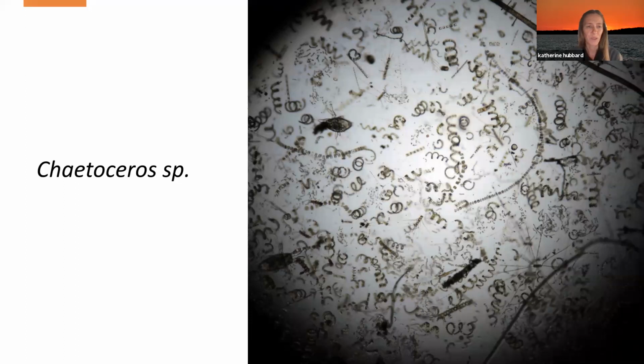And it's the same for Pseudonitzschia. Pseudonitzschia is weird because it's not always a toxin producer. But if you do have a toxic bloom, sometimes there are not that many cells that we see. And so whether or not we want to call that a bloom, or just be aware that it's there, again, as Dean said, keep your eyes on things and try to spread the word and contact somebody else who can confirm things and know whether or not there should be concern there.